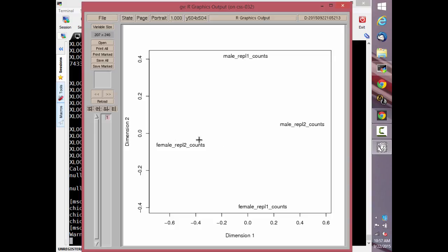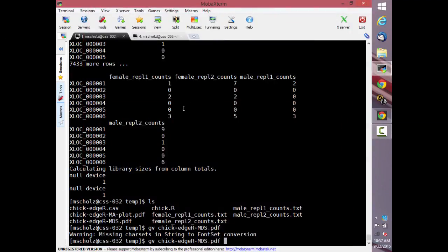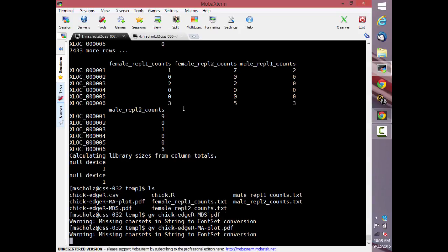So that pops up a great report. This is the MDS. I'll show you. Well, you saw yesterday how to deal with it, or how to generate it if you want, but we'll look at it again. And then here's the actual plot that we saw yesterday, eventually.